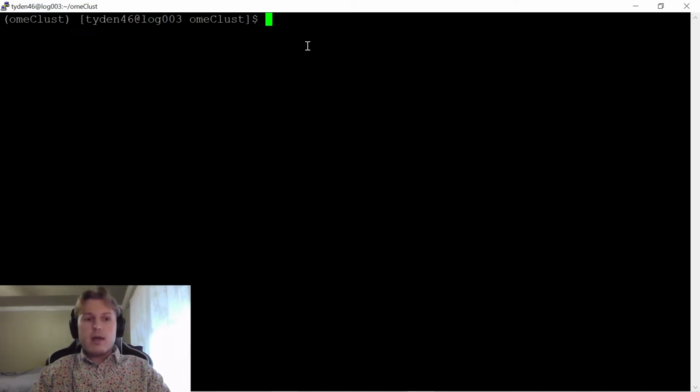Okay, so I have omeClust successfully installed. We can check that by simply running the omeClust -h command. It might take a second to print this out, but it's going to print out for us all of the different options that we have with omeClust.